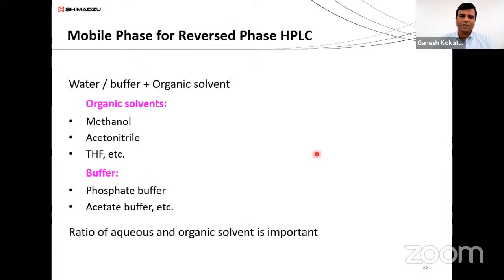But the mobile phase which we prefer to use is water or any kind of buffer with some concentration, and obviously some organic solvent to pass the solute, or the mixture of components, towards a detector.